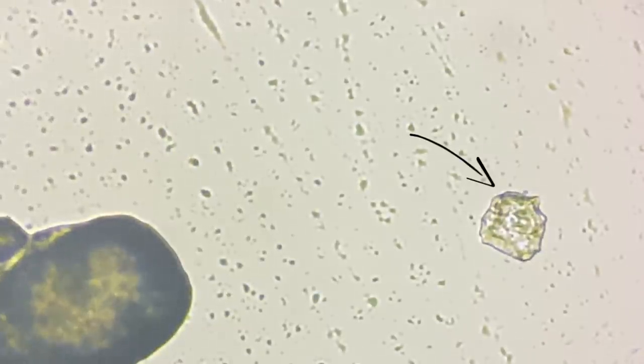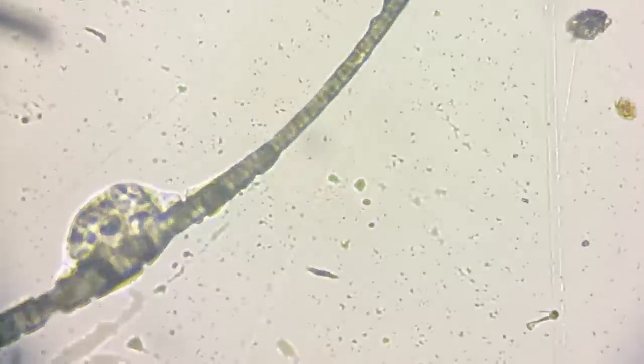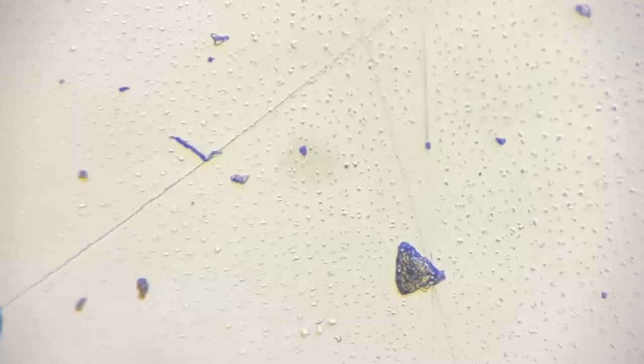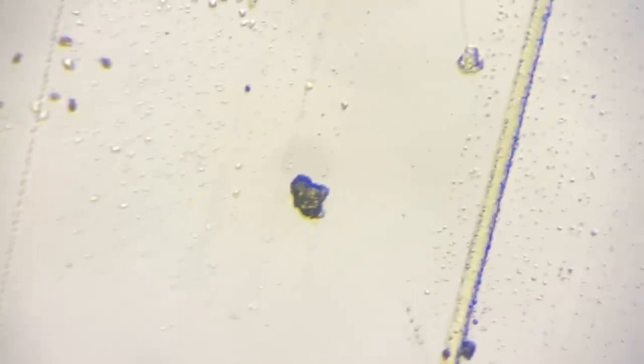That down there is a skin cell. Oh wow. Oh God. Is that a hair? That must be a hair with just some sebaceous stuff on it. You can see the scratches on my lens too. That's interesting. Mostly I'd guess that these are skin cells or just like flakes of skin — I think that's what's happening. And then hairs.